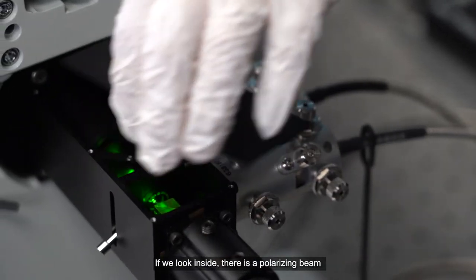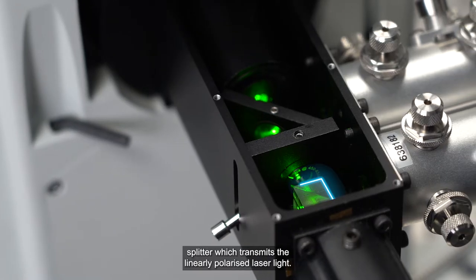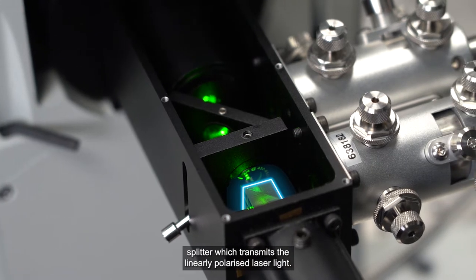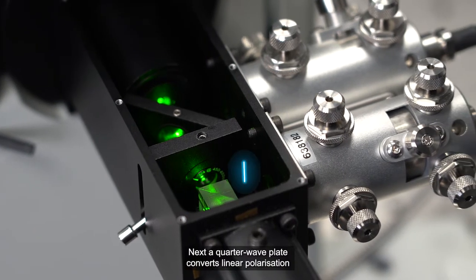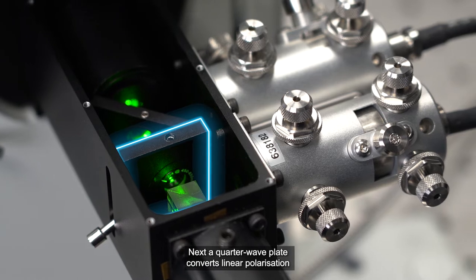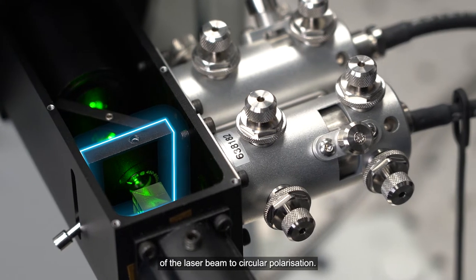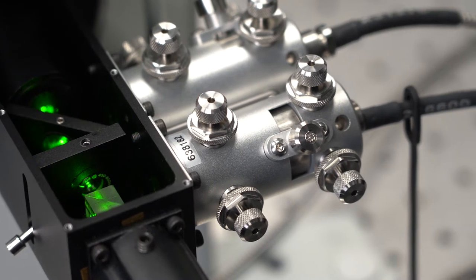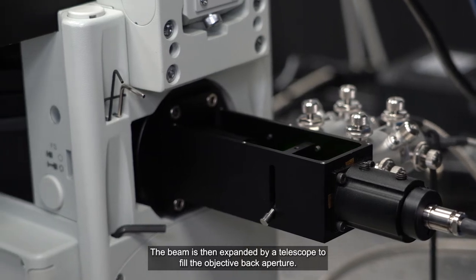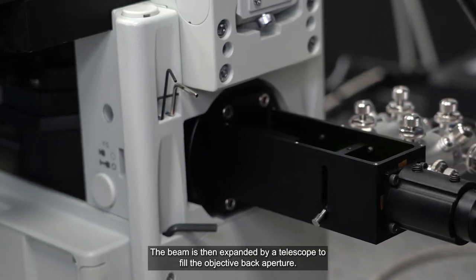If we look inside, there is a polarizing beam splitter which transmits the linearly polarized laser light. Next, a quarter-wave plate converts linear polarization of the laser beam to circular polarization. The beam is then expanded by a telescope to fill the objective back aperture.